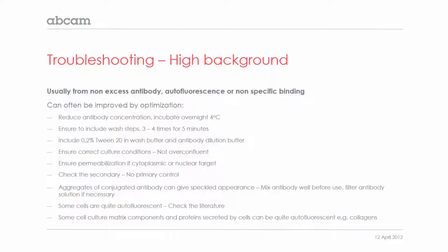Check that you have the correct culture conditions and that the cells are not overconfluent. Ensure there's permeabilization if it's a cytoplasmic or nuclear target. This sounds counterintuitive, but from experience, if permeabilization isn't done when required — for example for a nuclear target — you may actually get a lot of excess staining rather than no staining. So make sure you permeabilize if you need to. Check the secondary antibody by including a no-primary control to make sure it's not binding nonspecifically.